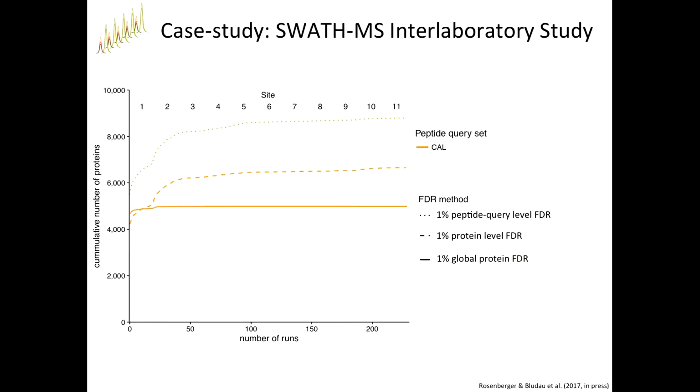If you analyze the same data set over and over again, and you're accumulating your targets, like the number of reported proteins, almost reaching library level, which is like 10,000 proteins, then you're definitely doing something wrong, right? It's quite hard to assess this and to see it in a heterogeneous data set, but this was a nice showcase where you should see a flat line, but we saw accumulation.